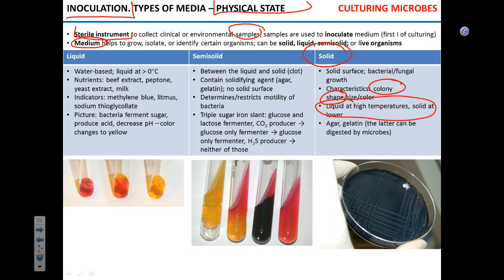Agar is produced from some tropical algae. You can eat it. So that stuff that's on the plates, technically, you can eat it. You're not going to die. It's not toxic. It's going to taste like crap, but it's not toxic. Okay? So you boil it, it becomes liquid.